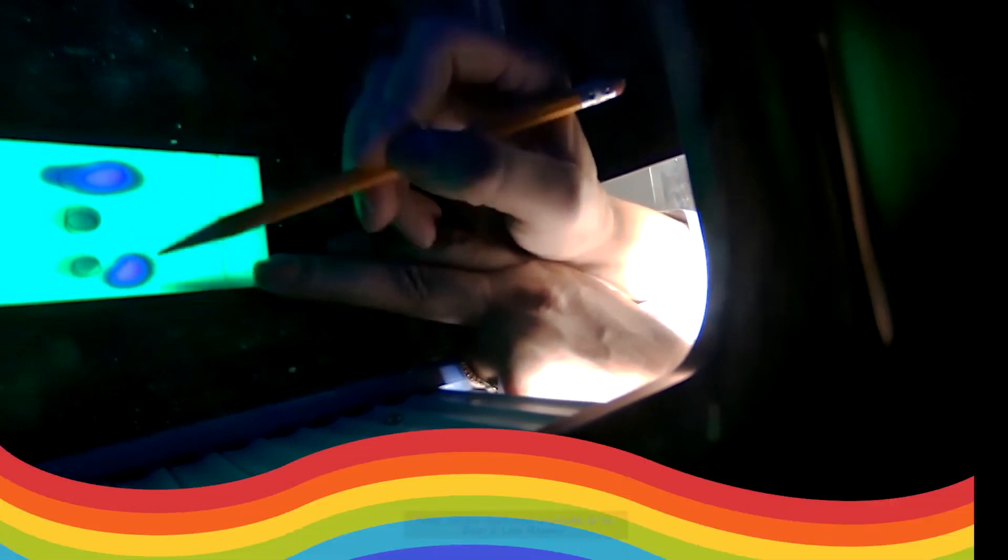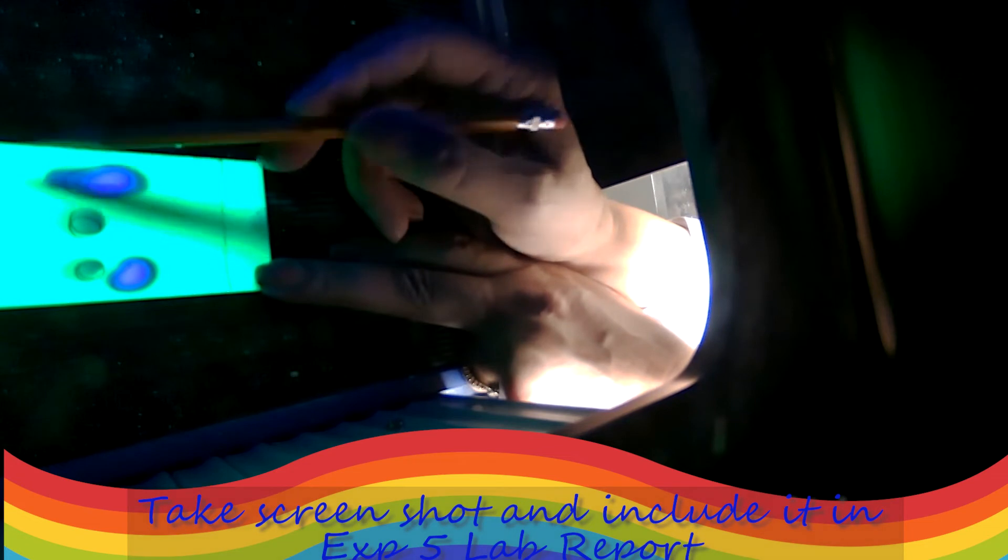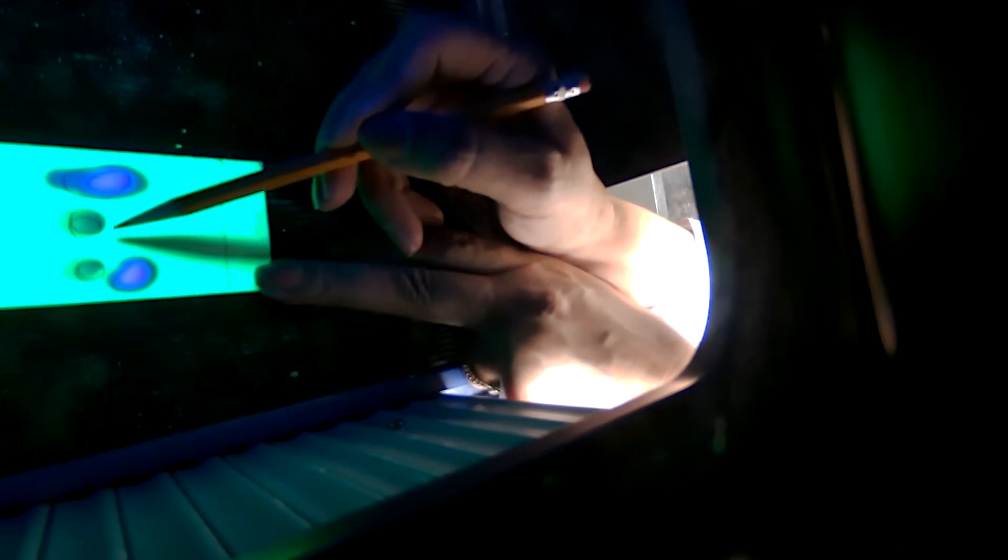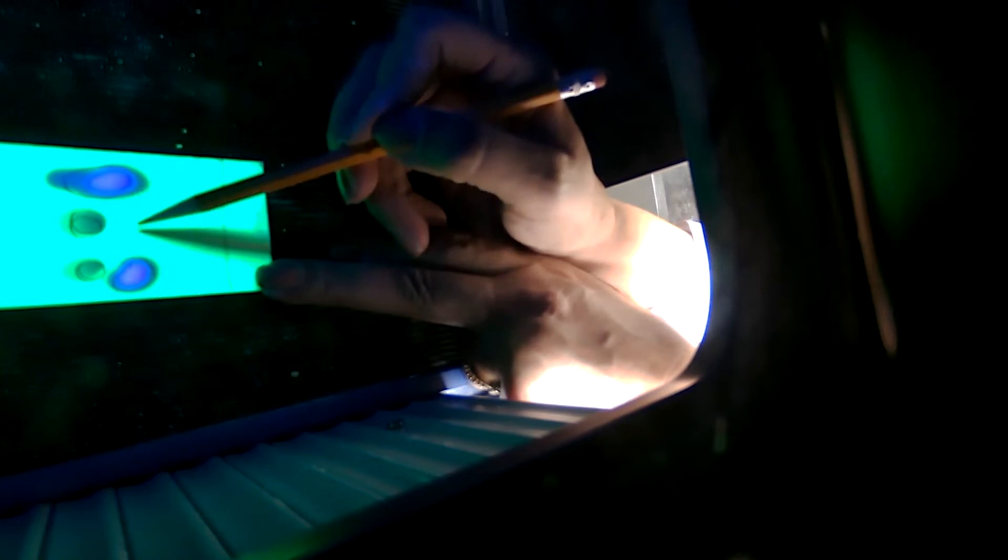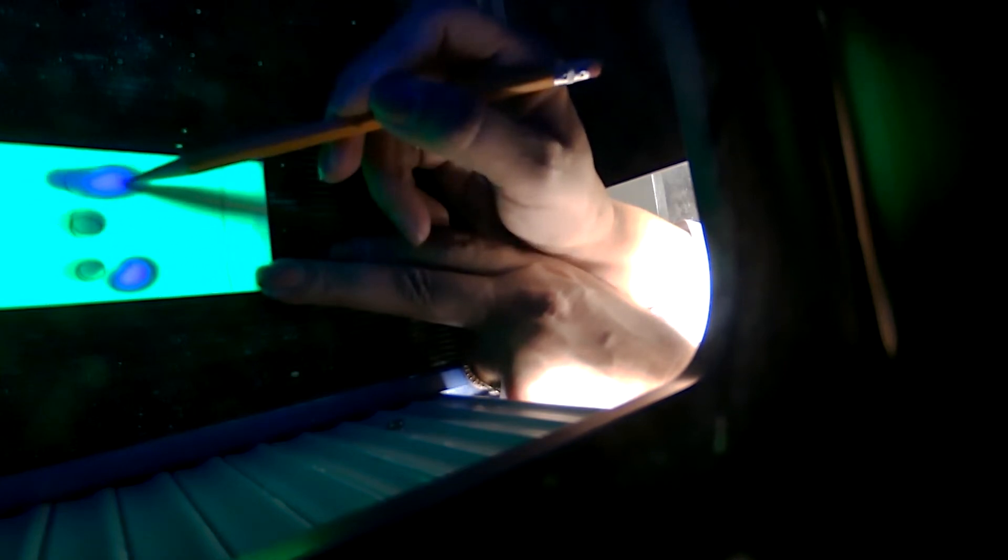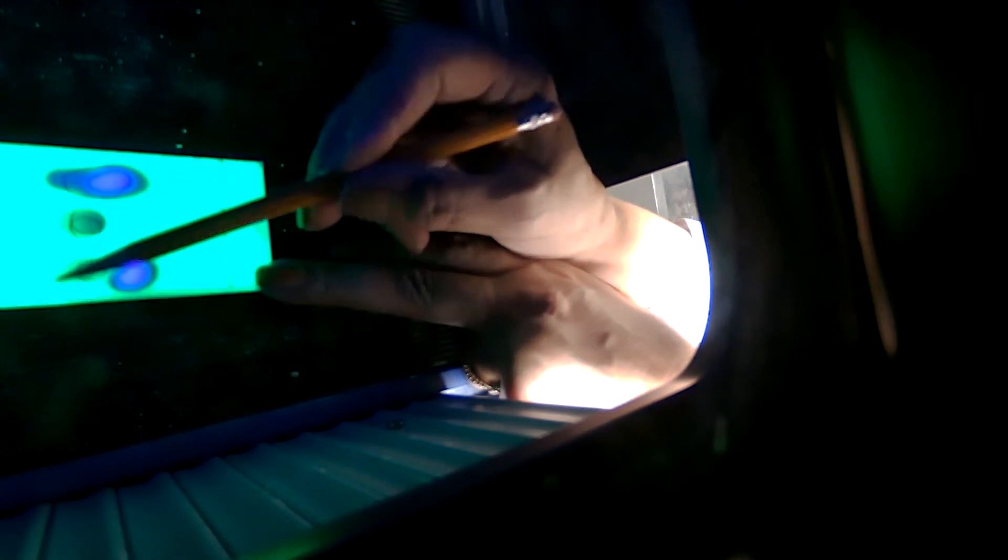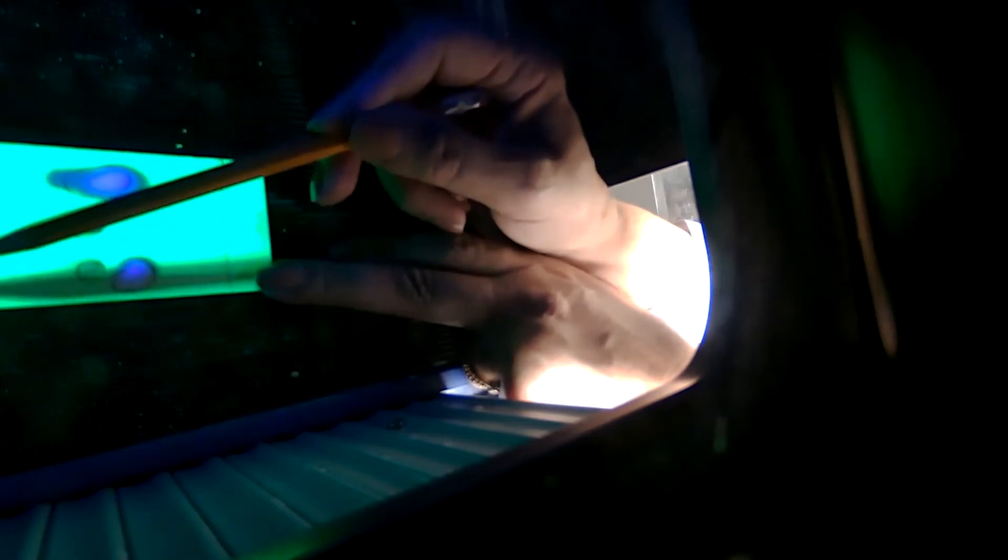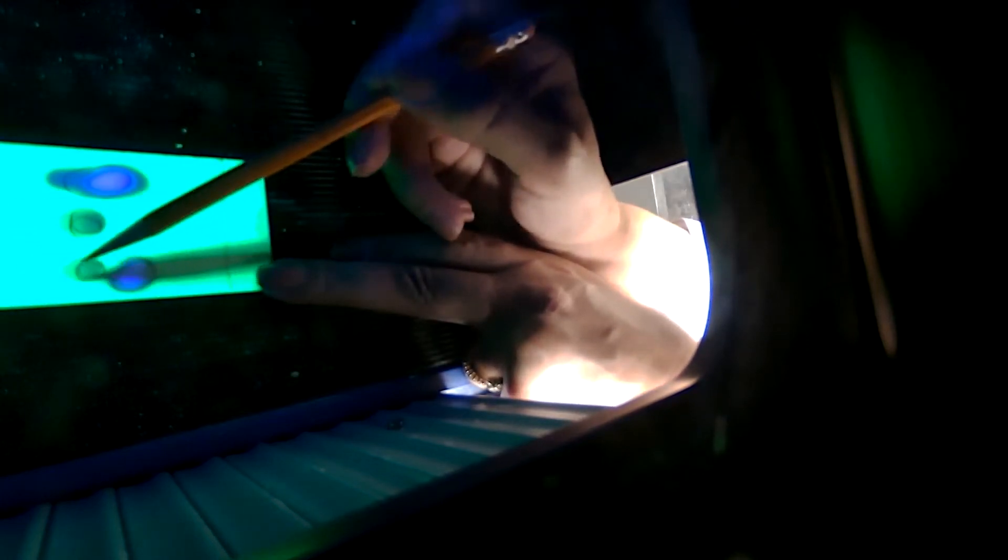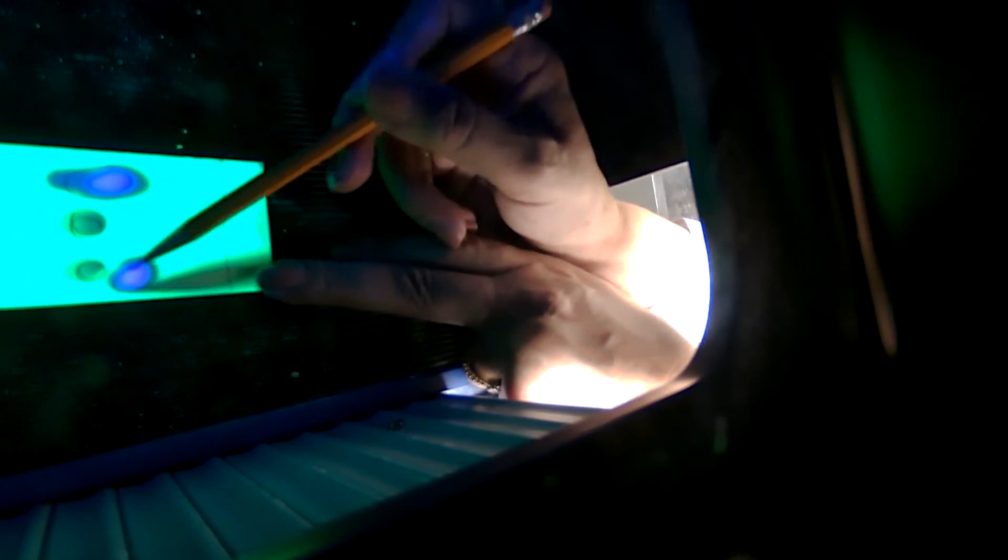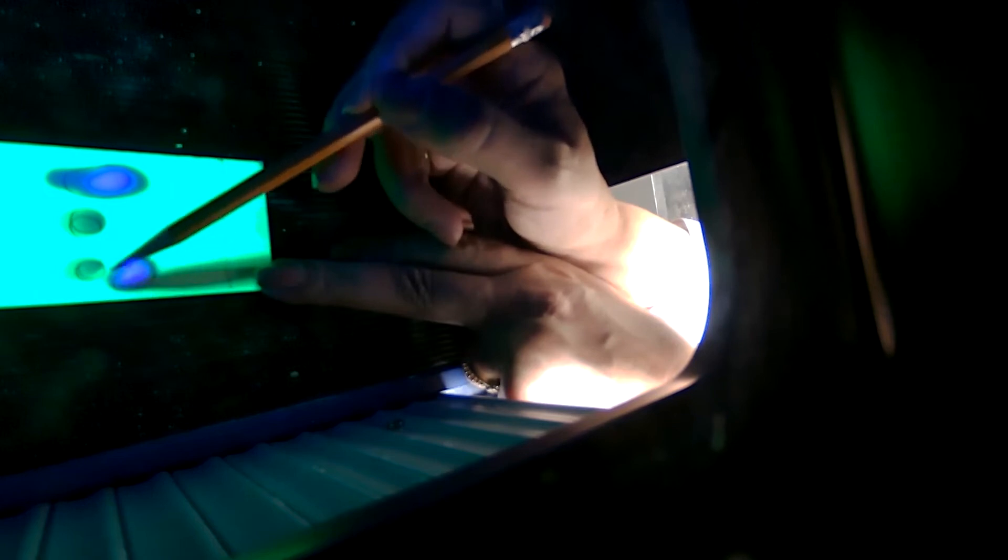We just want to see if the samples that were extracted or purified using extraction, does it show any impurity or not? If you look at the acid here, this actually doesn't show any mixture of the neutral compounds. Our acid compounds, our neutral compounds doesn't show any acid mixed. And I also, for comparison, I mixed the two samples with a smaller spot as a third sample. You could see that you do have the mixture of the two in the mixture. It shows both of them.